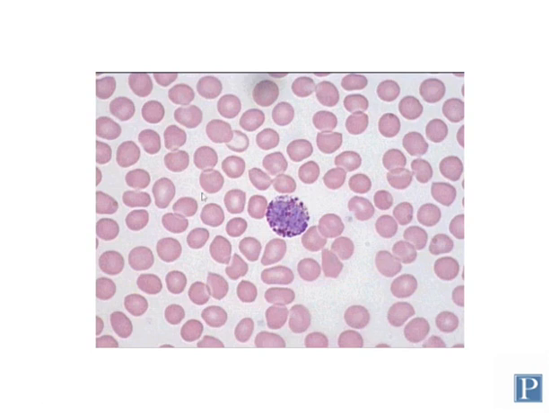This cell is a basophil, and basophils are even more rare than eosinophils. They are the rarest of the leukocytes, so you really have to look hard to find them. Again, if you find a good example of a basophil, please share it with your neighbors so they have a chance to see it. Basophils are the third type of granulocyte. So they differ from eosinophils in that their granules are basophilic, not eosinophilic. The nucleus is usually very large and irregular in shape, and is actually difficult to see because the nucleus is also basophilic, and so it usually gets obscured by the coarse basophilic granules.